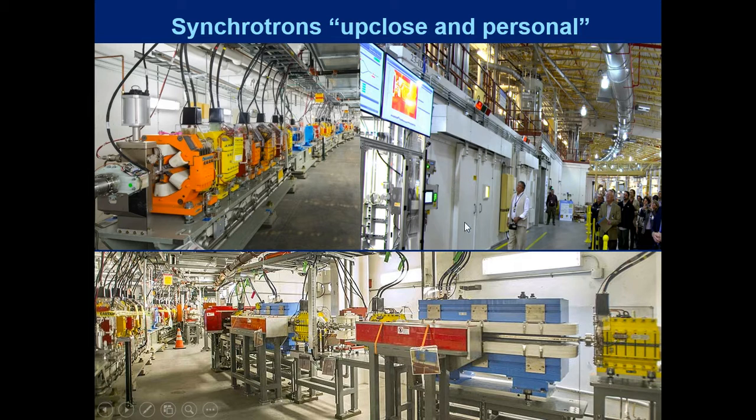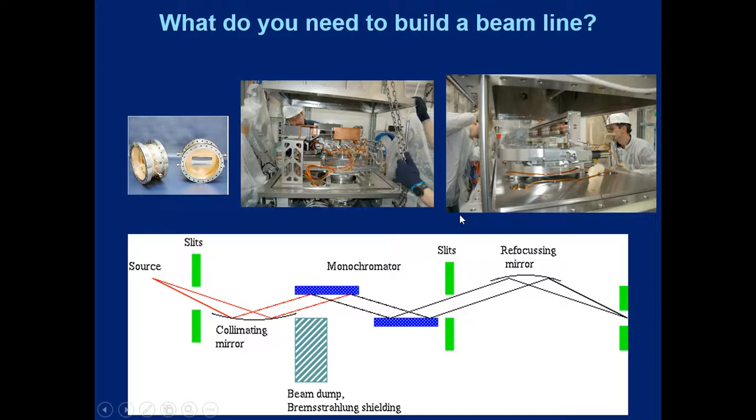These are solid lead. They're actually on these tracks. They can open and close electrically. And then this wall here is made up of lead as well to protect users from any X-ray exposure.